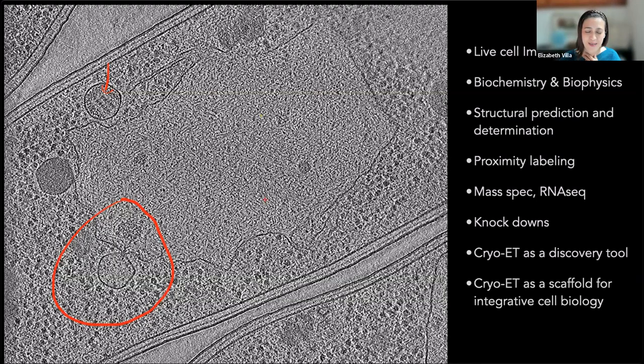This project, every time we take a look at a tomogram, we're like, what? Here I want to show you, I hope you can see it on the lower left inside this red circle. There's a pre-assembled genome inside the nucleus, and then you'll see one molecule of DNA going through the portal, getting injected in the phage. But it seems to be the case that the genome gets pre-assembled inside of the nucleus before it gets threaded into the capsid. So you can imagine, you would basically make a ball of yarn before you start knitting a sweater. So there has to be a DNA organizing protein that we haven't found, but definitely would look at, et cetera, et cetera.